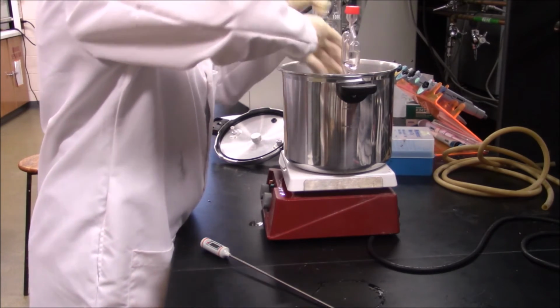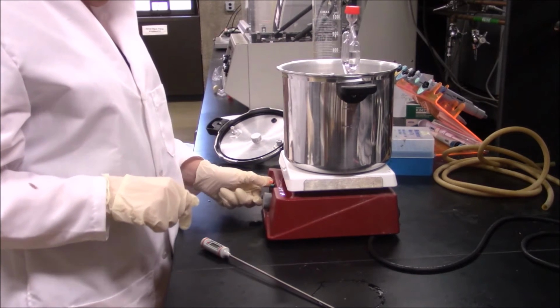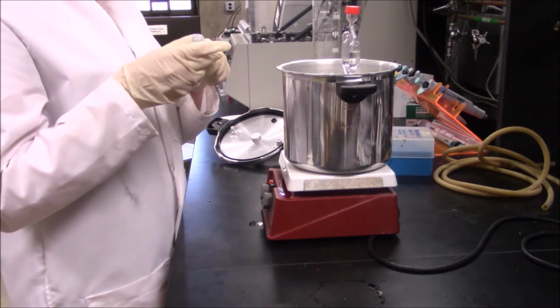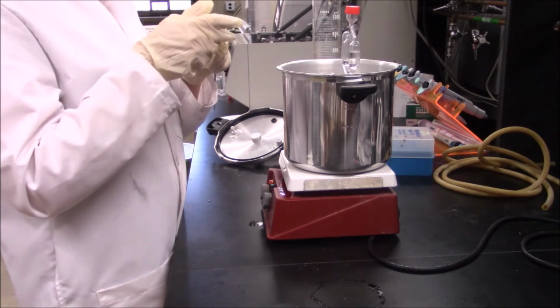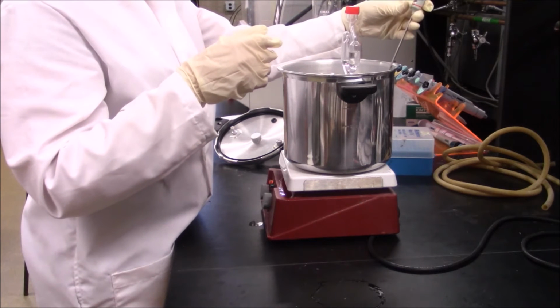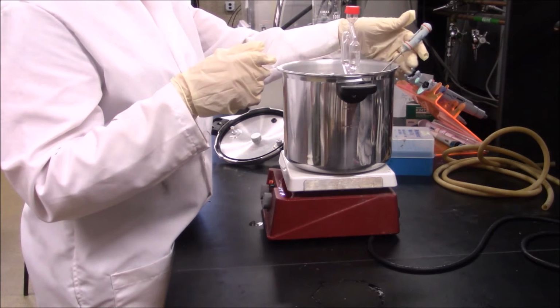If there is concern about the hot plate being left unattended during the day or overnight, the flasks may be left on the lab bench or under the fume hood at room temperature. Although enzymatic hydrolysis and fermentation will still occur at this temperature, enzyme hydrolysis will be very slow.